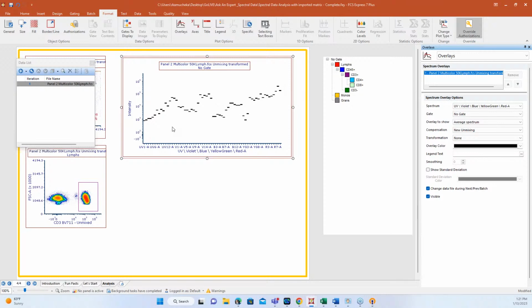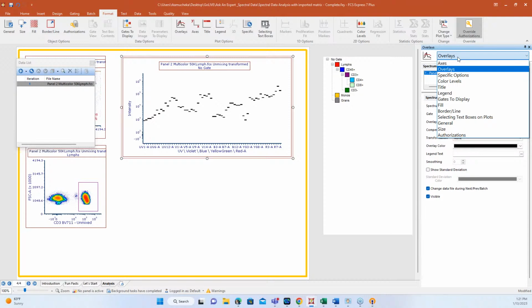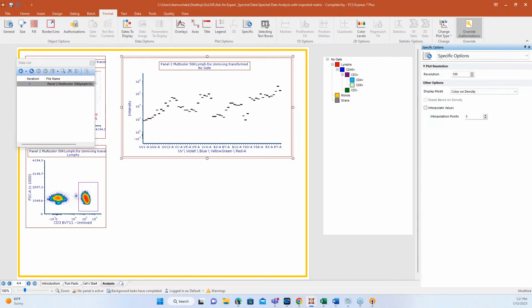Now it does kind of do the binning, right? So for each of the detectors, you see that highest level point, but don't worry, we can do formatting to take you out of that. We can change this so we can connect this. It's called interpolation, and that's in our specific options here. We select the option to interpolate values, and then we can change how many points. This is similar to smoothing on a histogram. You can increase this as much or as little as you need to.